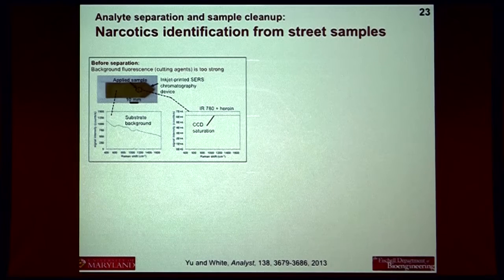Have you gotten to blood yet? So we have, blood is an application that we're looking at as the follow-up to this. There's a few people talking about this application, and some SBIRs are out there about this, of looking at drug load in blood over time. So that's a case where you look at a small molecule in blood. So we look at it as essentially trying to do the exact same thing: finding drugs that are good matches for doing SERS and then finding the right mobile phase. A spectrometer company has actually asked us to collaborate with them on that. So it's one of those next steps to follow up.